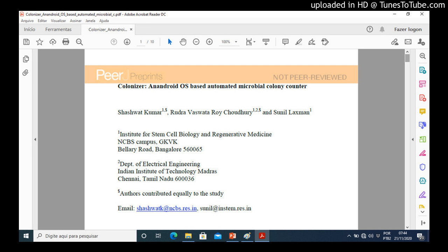500 colony plates for typical laboratory microbes such as E. coli and S. cerevisiae.